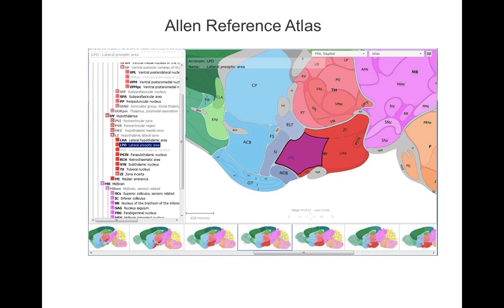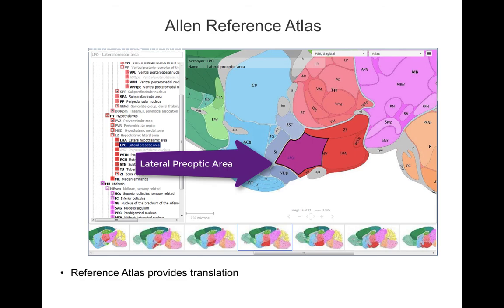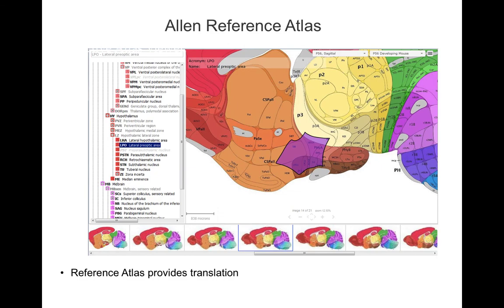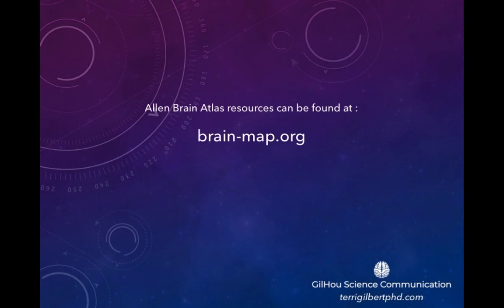By registering the two ontologies into the same reference space, you do have the ability to translate between the different structure names. A structure in the adult mouse brain, for example the lateral pre-optic area, or LPO, can be overlaid on top of the developing mouse brain atlas, showing which developmental structures it aligns with. This brief review of the data in the mouse gene expression atlases should be sufficient to give you a jump start to exploring the data and tools at brain-map.org.